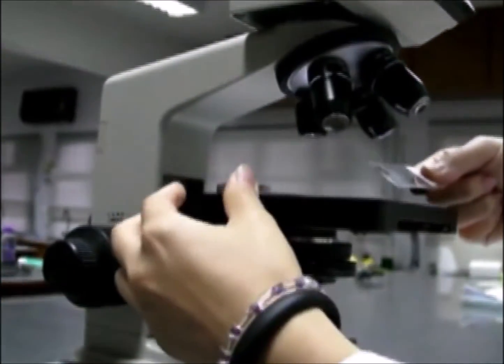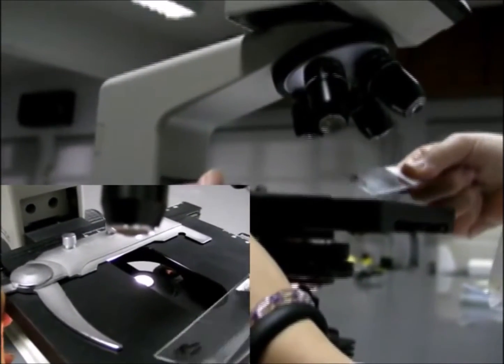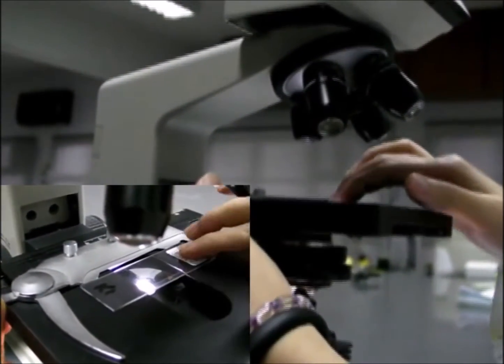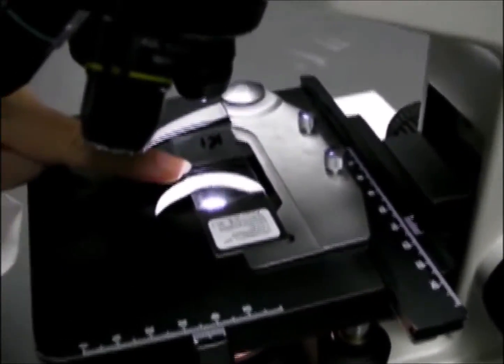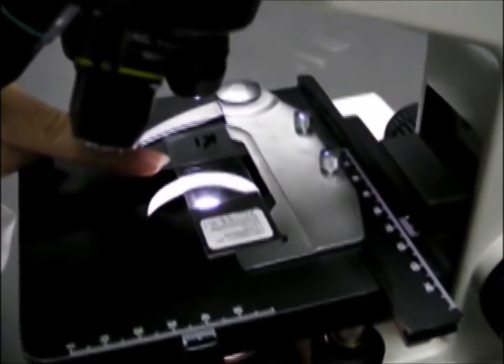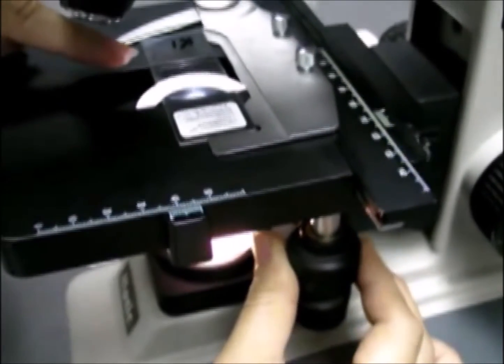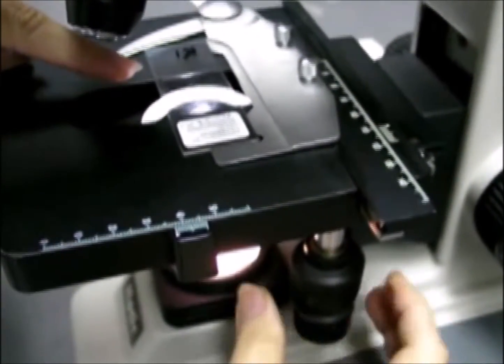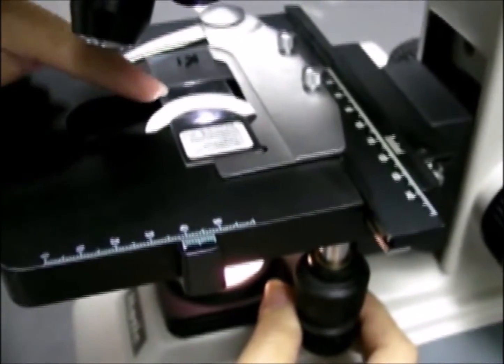Open the clip. Place the glass slide to the center of the stage. Release the clip and it will hold the glass slide securely on the stage. Adjust the glass slide so that the light passes through the specimen. If not, you will not see the specimen when you look into the eyepiece.